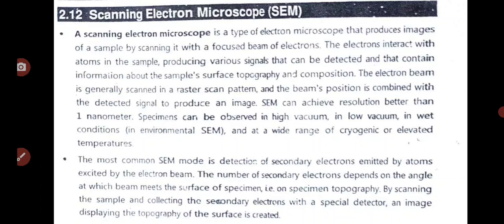By scanning the sample and collecting the secondary electrons in a special detector, an image is produced, displaying the topography of the surface.